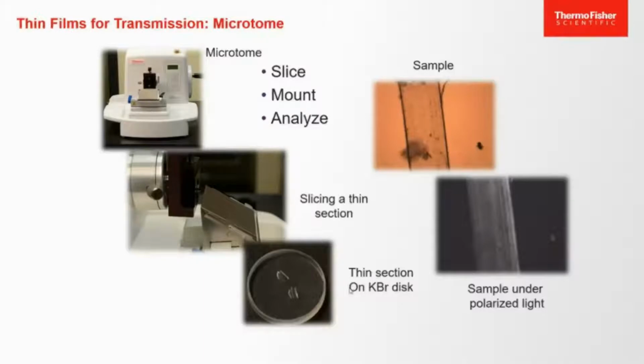I think the first time I ever saw one of these was in the movie The Andromeda Strain, when they're cutting a piece off that they've embedded in the epoxy. And you can see them when they shave it off. It's kind of neat.